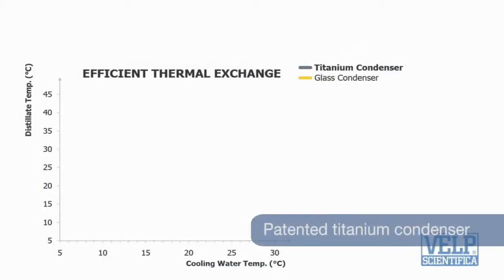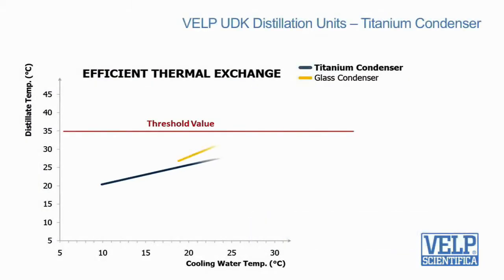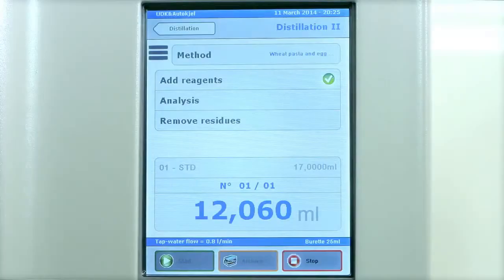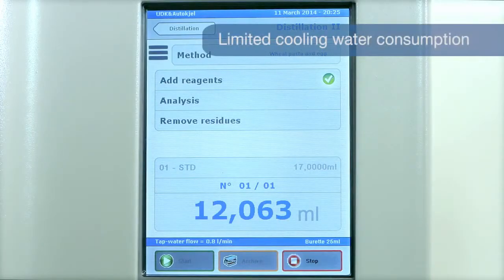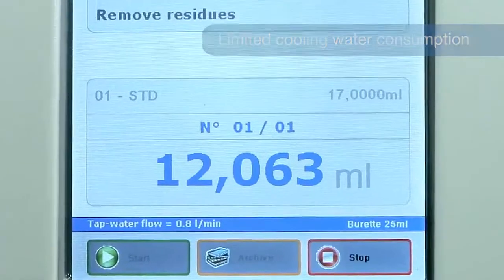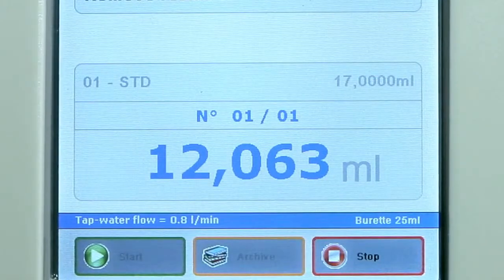The titanium condenser ensures precise determination since the distillate temperature always remains below the threshold value for total nitrogen recovery. In addition, it offers the lowest cooling water consumption starting from only 0.5 litres per minute.